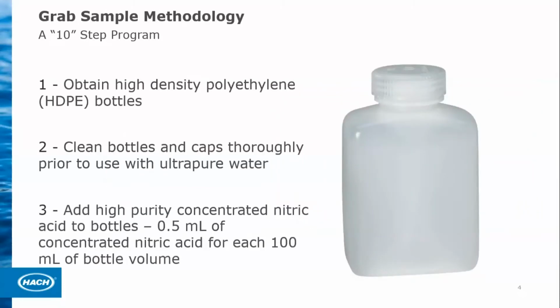What I am going to talk about here, and this is grab sample methodology, is a 10-step program. And this can be found directly in the IAPWS technical guidance document on corrosion sampling. So there's a lot more detail there. And again, it's freely available to everyone, whether you're a plant owner, operator, consultant, water treater, whoever you are. So I want to go through this because I think it's real important if you are doing grab sample, that you do it properly.